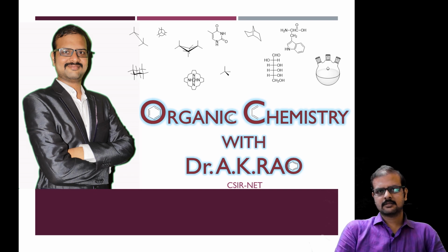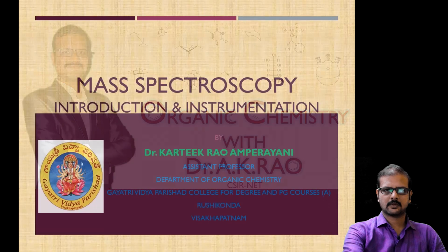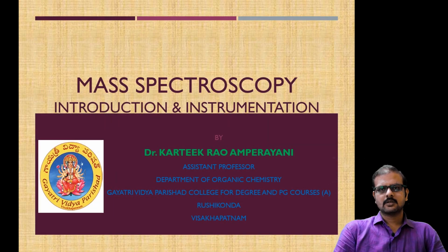In our topics, today I am going to deal with mass spectroscopy. In this session, I am going to discuss the introduction and instrumentation part. Mass spectroscopy deals with the structure of a compound.